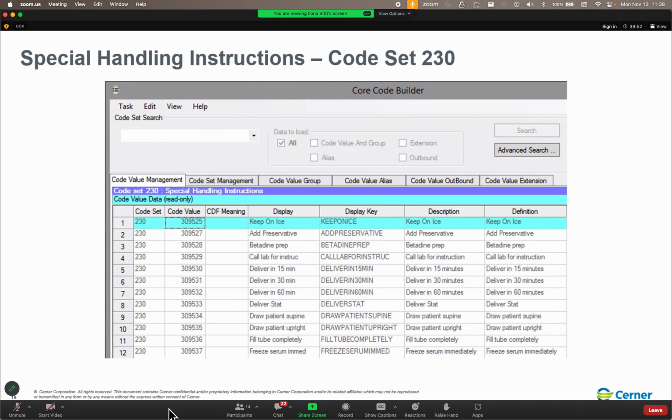So folks, I want you to do that on your chemistry manual bench and on the all bench row, all bench or instrument row. And folks, the reason why we have this all row down here, it is a safety net row. This is the set of collection requirements that will be applied if we don't find a matching row up top based on the service resource age collection priority combination.